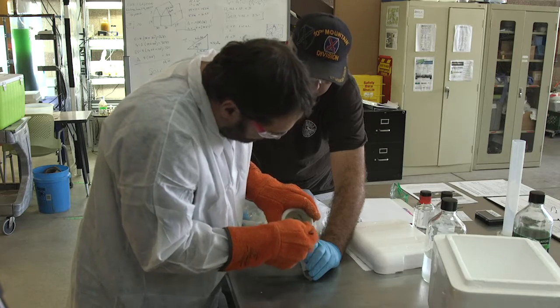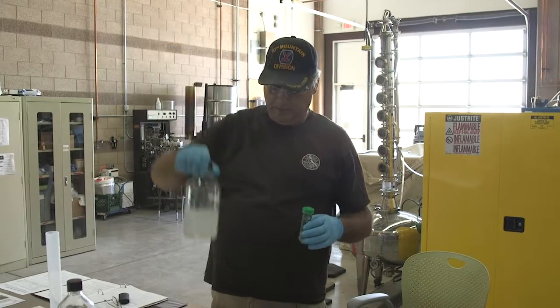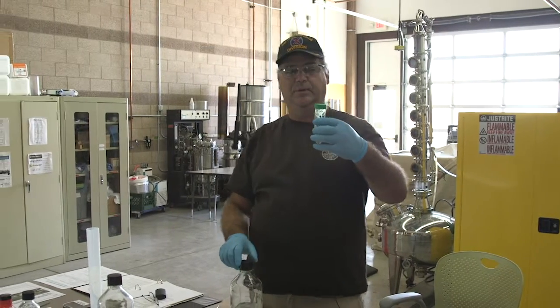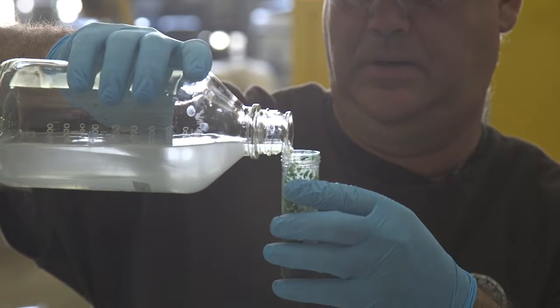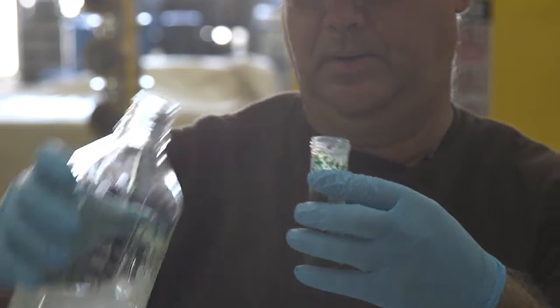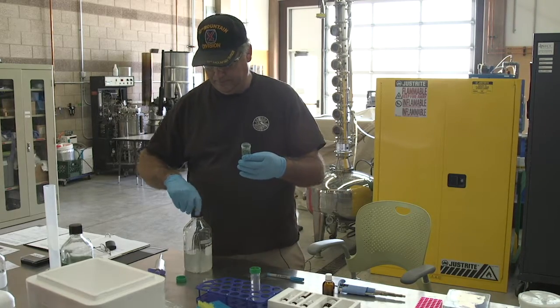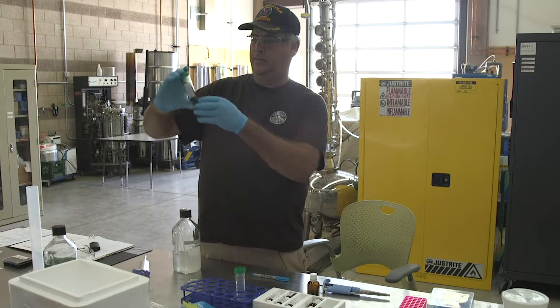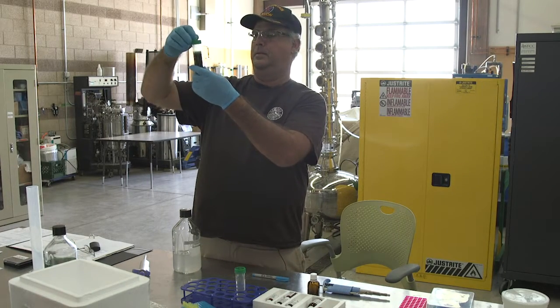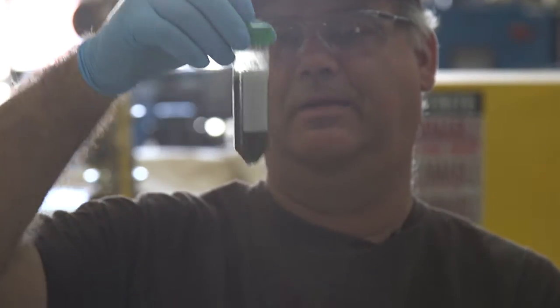We have this salt water here that's twice the salinity of the ocean, and we use this to help pop the cells open. This is a 50 ml tube and we'll add about 30 ml of this salt solution. Then we just have to let it sit and let gravity do its thing.